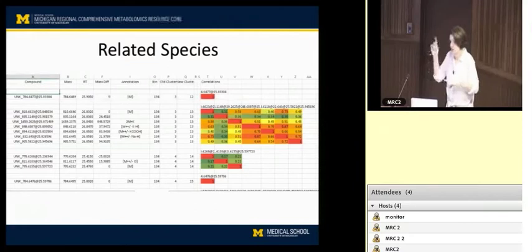And also, for example, a PCA plot will tell you if we're able to see any separation. There are always situations in which there are too many factors that have to be considered, and you're not getting good separation just based on what you thought you were. You thought that the main effect that you're looking for was going to be diet when in fact it was age.